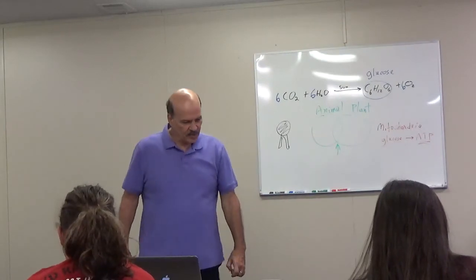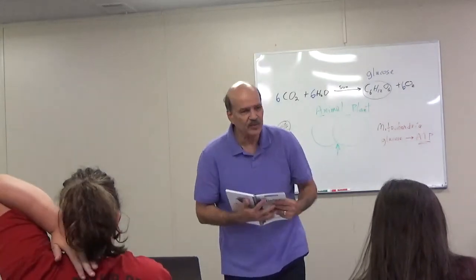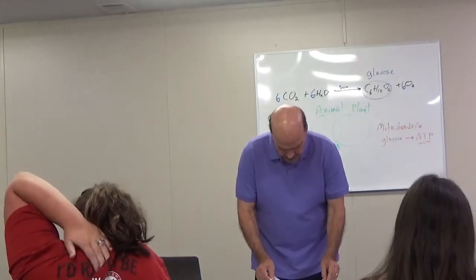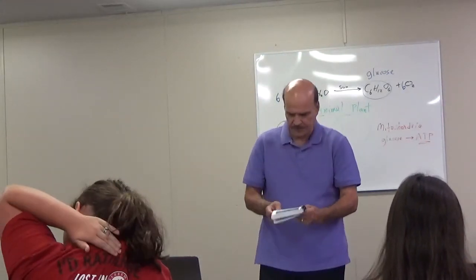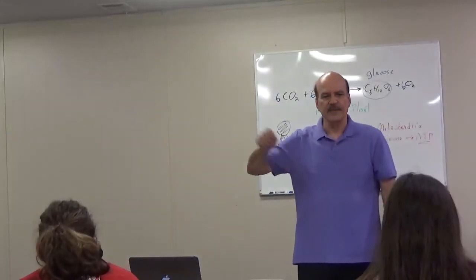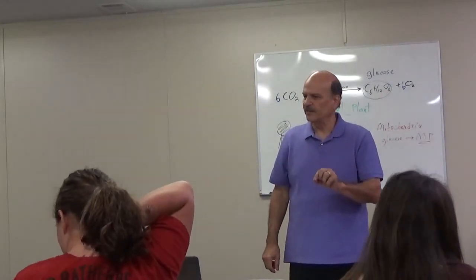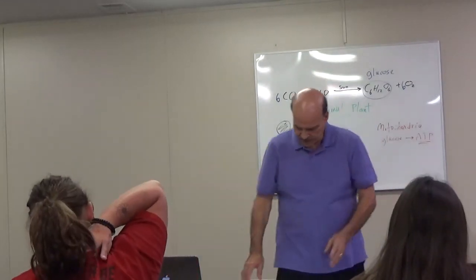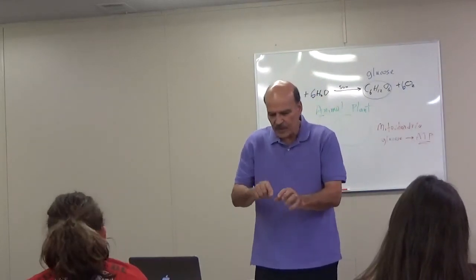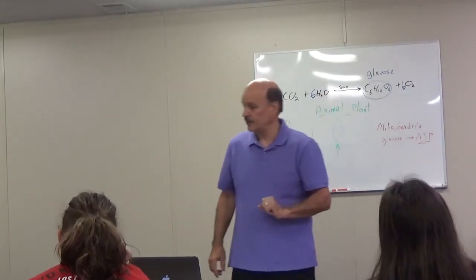Any questions about what you're supposed to be doing? I would say take really good notes now. We're going to be comparing animal cells to plant cells. The plant cell we're going to be looking at again is scraping a potato and getting that on the slide. Now, most of you found that when you added the drop of dye, it was too hard to see. So maybe put it aside and take a toothpick and just put a little bit and stir it around so you don't have too much dye.